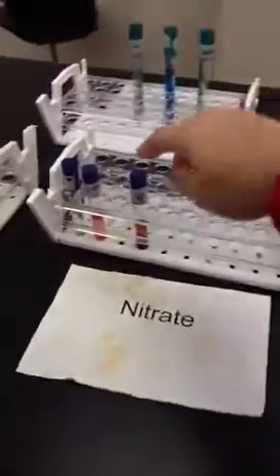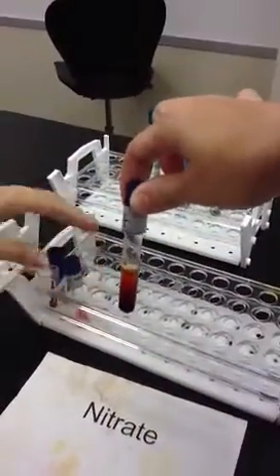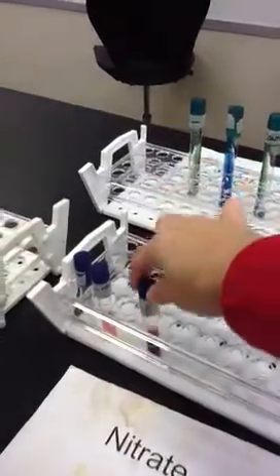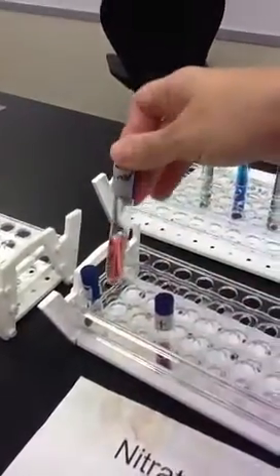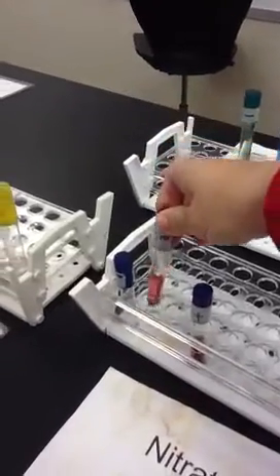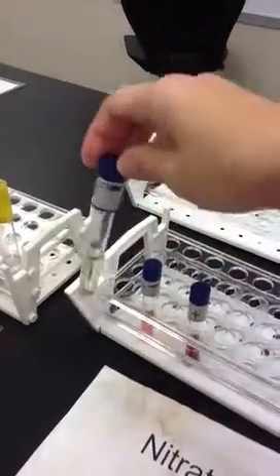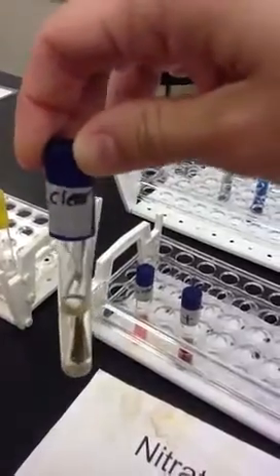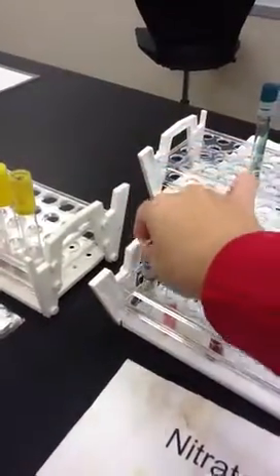Okay, so this is what? Is this a positive? They're both, yes. This one's positive. It says slide boxes on the door. And this says negative red. We'll have to look that one up. And this is then... The control. The control. The control. Starts out clear.